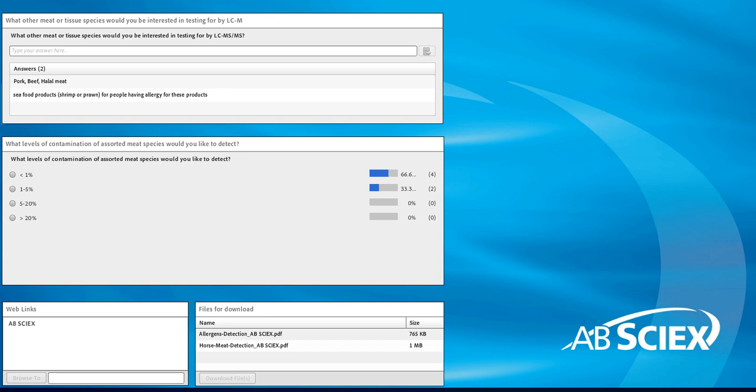Yeah, I think the levels probably match what I hear from the industry. About 1% is typically demanded as a sort of LOD, so that's why I designed the method around the 1% detection limit. With regard to speciation, that again confirms what I'm hearing from other people in the industry I speak to, especially around pork and beef. And we are developing markers for those. This is just the first stage in a process where we're developing future methods for meat speciation, and I'm working with academic researchers to increase this list.